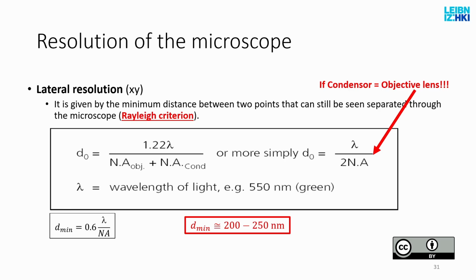This is already extremely important because if you say, I want to see, I don't know, nanoparticles that are 100 nanometers, and I use nanoparticles to deliver drugs to a tissue, cure the liver, whatever. You cannot see them. You will not be able to see individual nanoparticles because they are too small. They are below the resolution of the microscope.